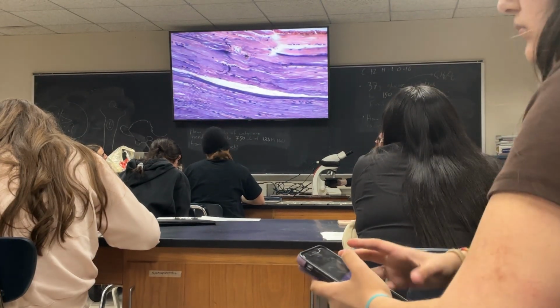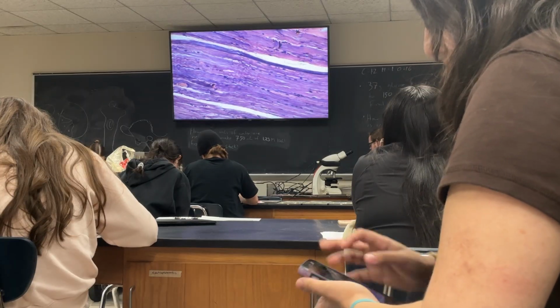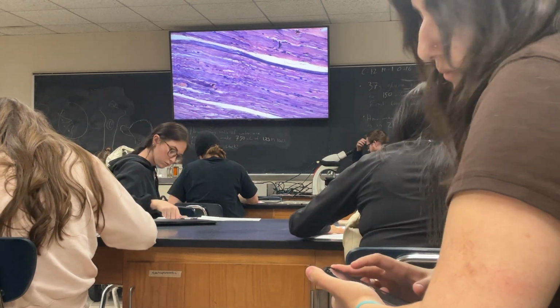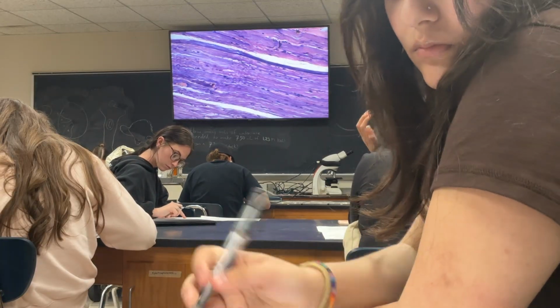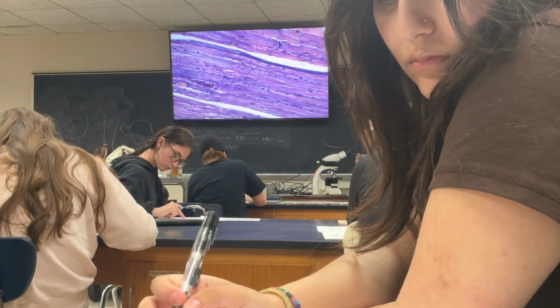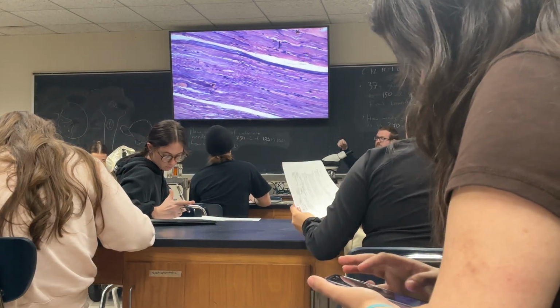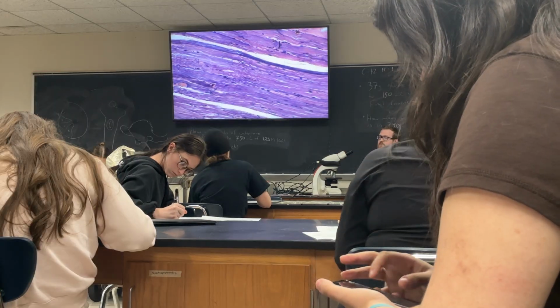But look at the sheer number of nuclei. And this is one of the tables on page 15. It asks for multinucleated or uninucleated. Skeletal muscle is heavily multinucleated. You're expecting to see dozens of nuclei per cell. So I look at this and I see a lot of nuclei and I see striations, therefore it's not smooth muscle. There's a lot of what could be cells there, but instead it's a lot of nuclei fused into one.